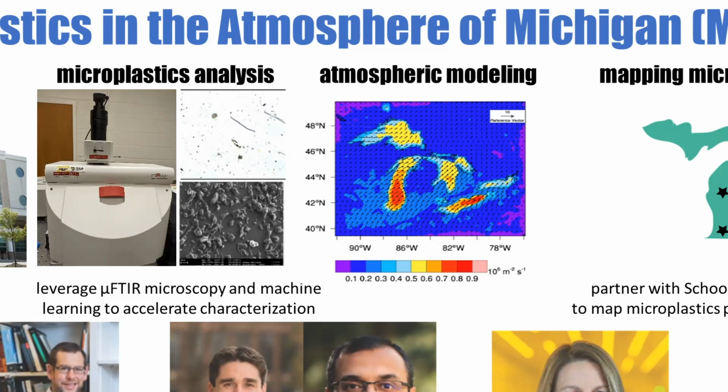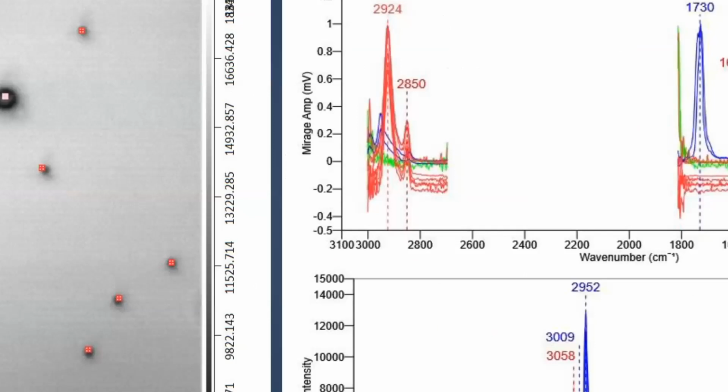And so we turned to photothermal and said, hey, we're really interested in this. Is this something you think your instrument can handle? We got a sample together the same way we prepared them when we sent them to the couple of other folks, and we ended up getting some data back that was really exciting. Here you can see we put 3 different types of plastic particles on this silicon wafer. Over on the right side, this is using the QCL that has the CH stretching region, which is going to be really critical for our analysis, where you're able to identify these different polymers, the red, the blue, and the green.